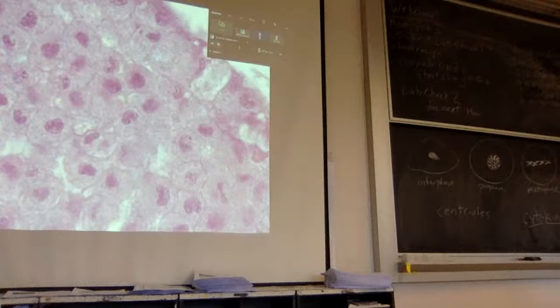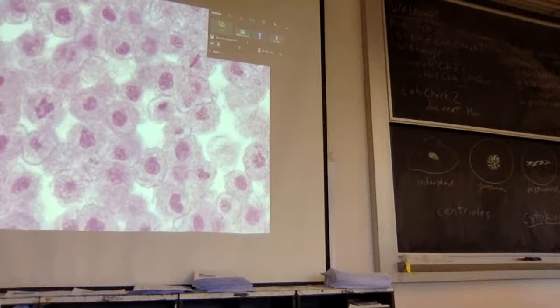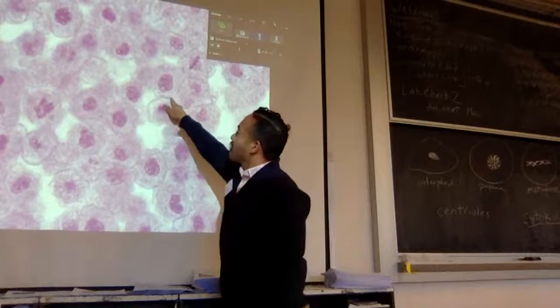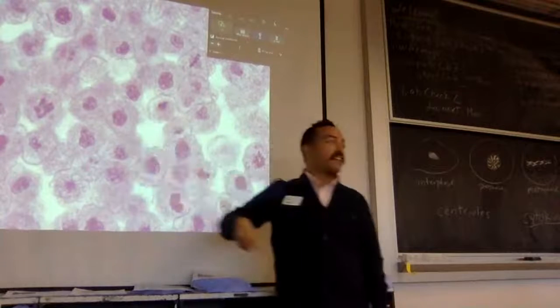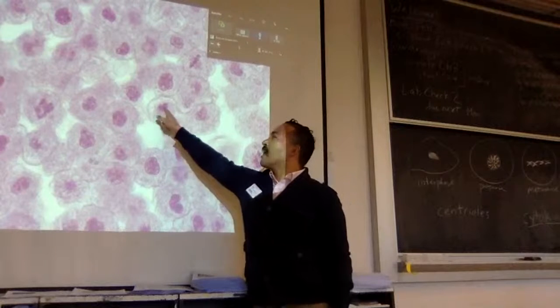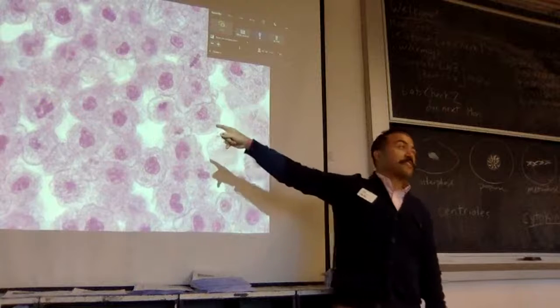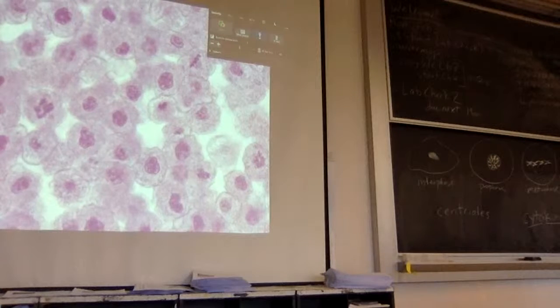Professor, I would just pass one. Oh, here's one, not an anaphase, but you see this? What's that? That's telophase. See how the cytokinesis has happened, but it's still slightly attached, and the chromosomes have separated to either side? That would be telophase. This one's pretty hard to find, but that's telophase. So I haven't found anaphase yet.